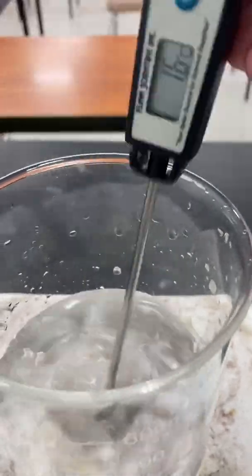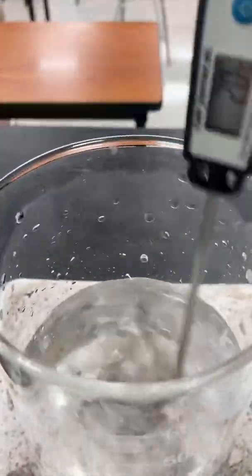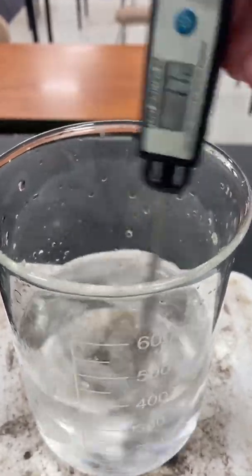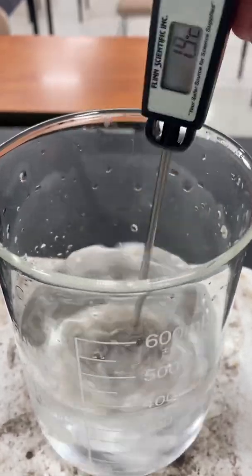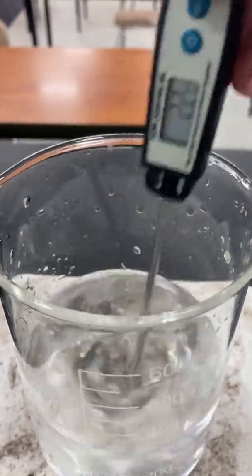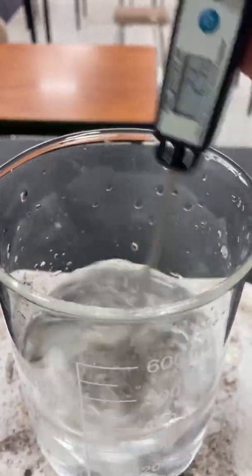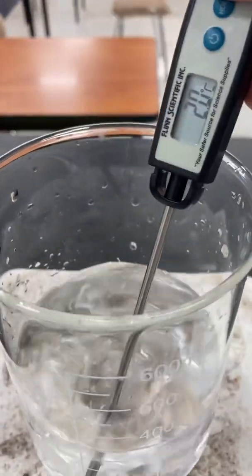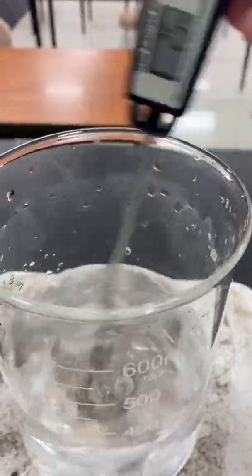So, okay, 30 seconds later, we have 1.7. So let's measure 30 seconds later. And I think you can hear in here, I still have a bunch of ice inside of my beaker. So check this out. We're stirring. Okay. So it looks like 1 minute and 30 seconds. 2 degrees Celsius, so barely changing the temperature early on. And again, just by the jingling, I hope you can see that we have ice in there.